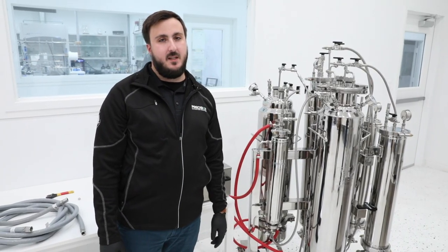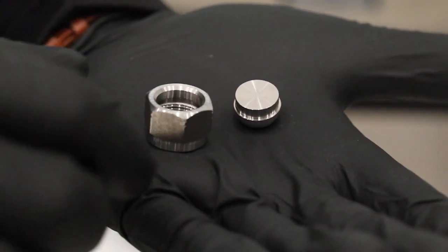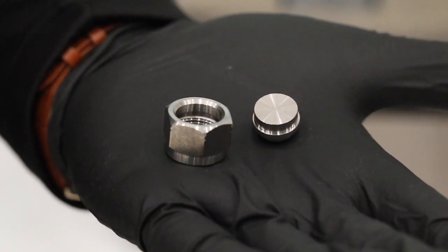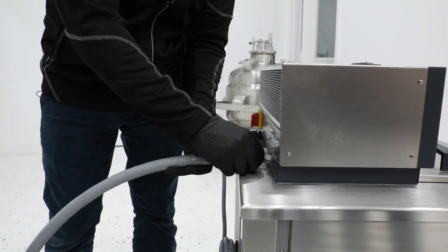Now that the heater is plumbed to the system, it's time to hook up the chiller. Just like the heater, you'll need to remove the plugs from the input and output ports on your chiller. Connect the supplied stainless steel hose to the output port on the chiller.